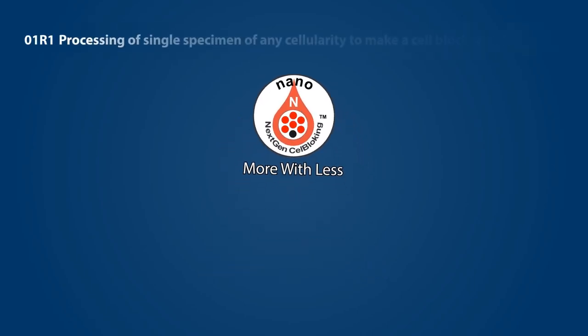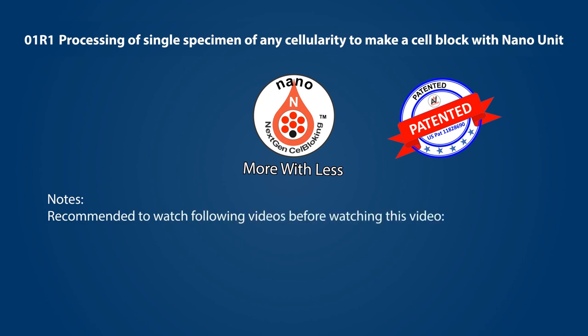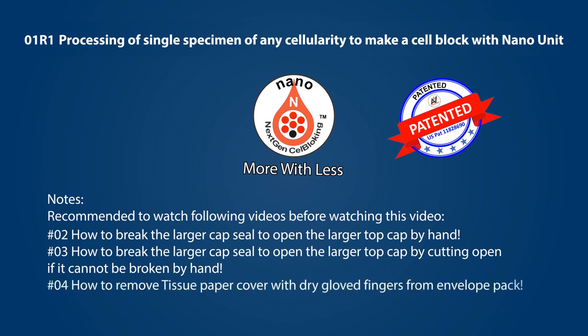This video covers processing of a single specimen of any cellularity to make a cell block with the Nano unit. It is recommended to watch the following videos before this one: how to break the larger cap seal to open the larger top cap by hand; how to break the larger cap seal by cutting if it cannot be broken by hand; and how to remove the tissue paper cover with dry gloved fingers from the envelope pack. The videos proceed at a rapid pace for quick viewing — please pause and play as needed.